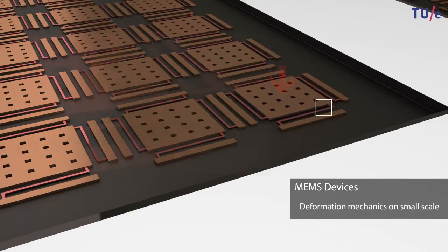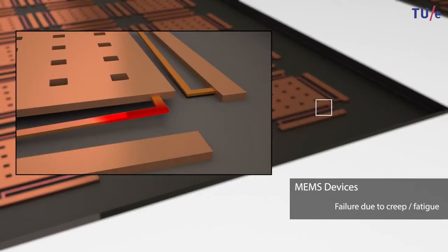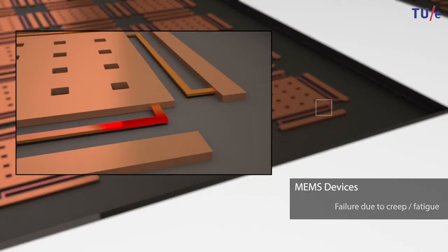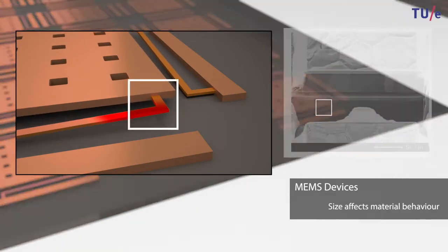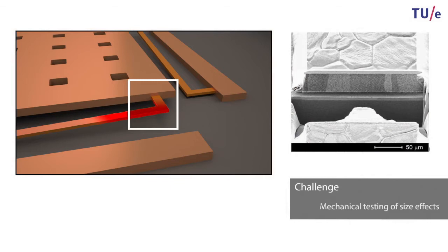Failure mechanisms, like creep and fatigue, exhibit different mechanical behavior when the internal microstructure length scale becomes comparable to its geometrical scale.